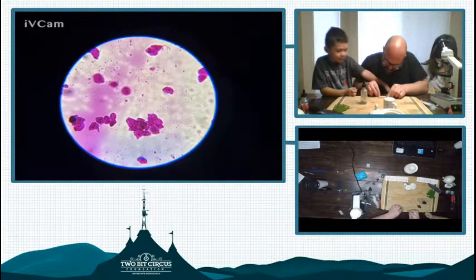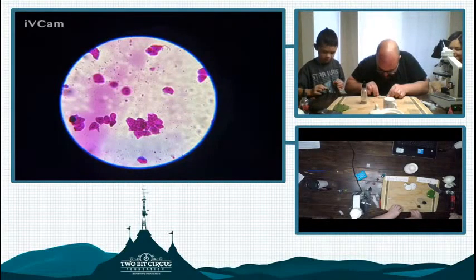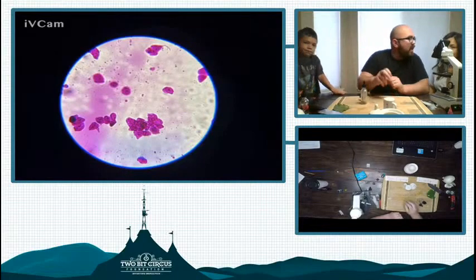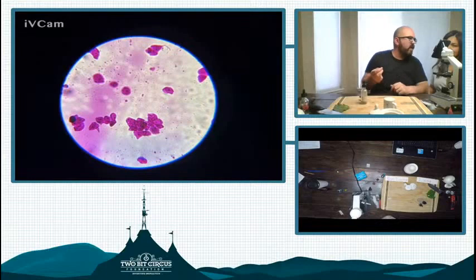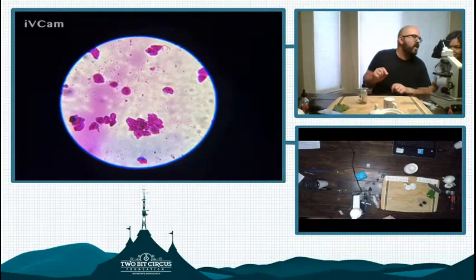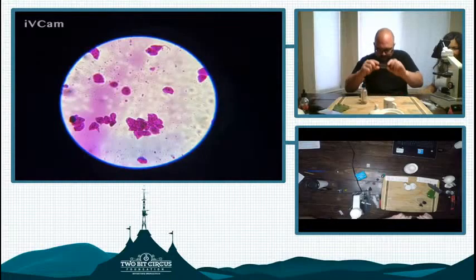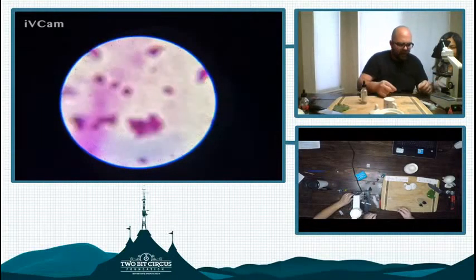Now, while I'm prepping this slide real quick, I could mention that if you look at Robert's cells that you have under there, you could actually see some stuff that adds different colors. So some stuff is really dark, some stuff is lighter. And if you look, there's a little tiny point, usually somewhere in each cell. I wonder what that is.